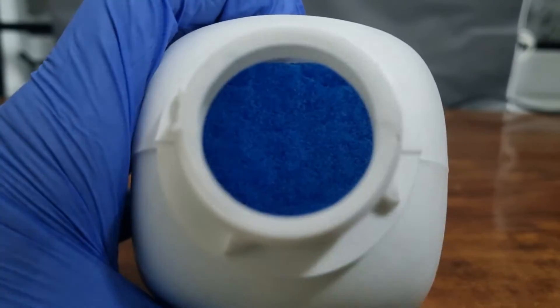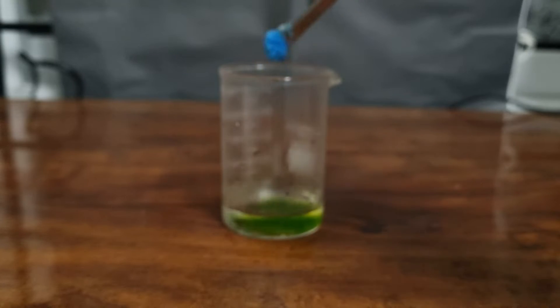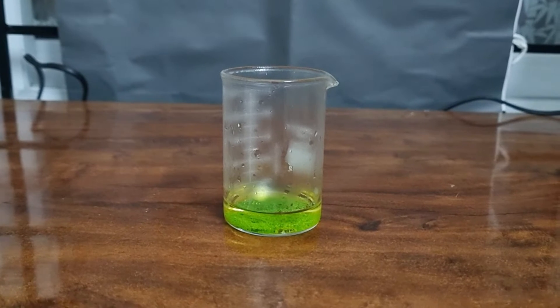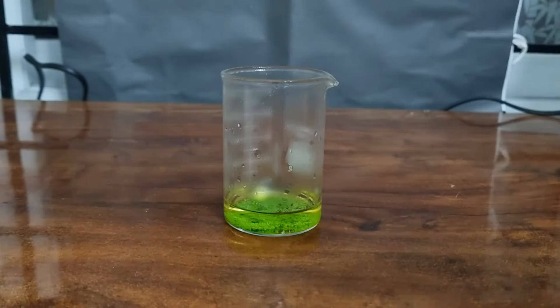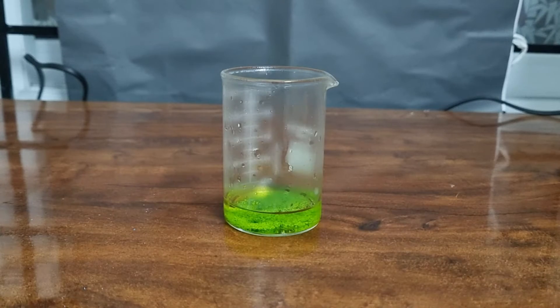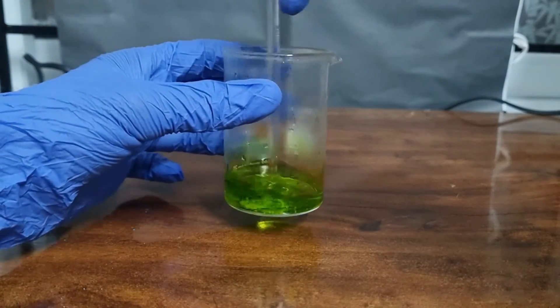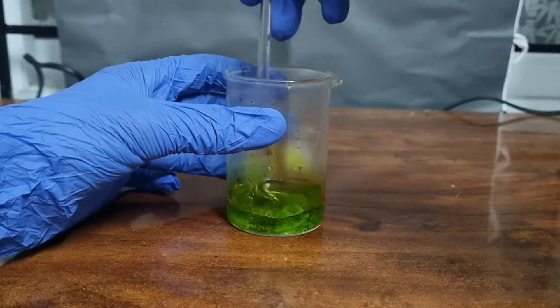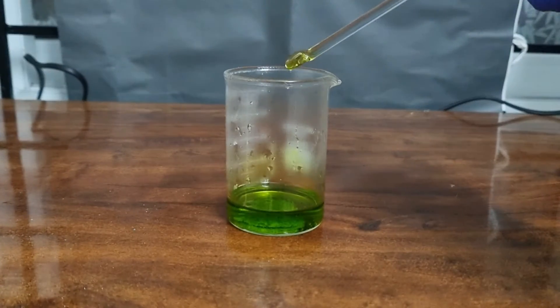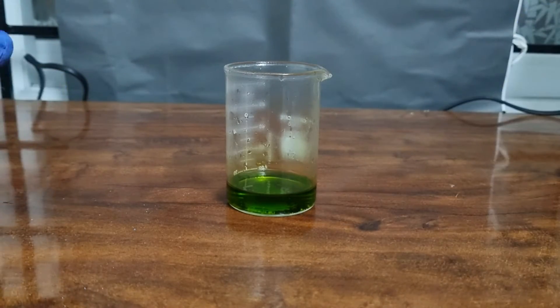I'm going to add some amount of copper sulfate into this beaker. When I add the copper sulfate, you can see it changes from blue color to green color, which shows that our experiment is working. Now I'm going to stir and mix it well. You can see it has changed color from transparent to a dark green color.